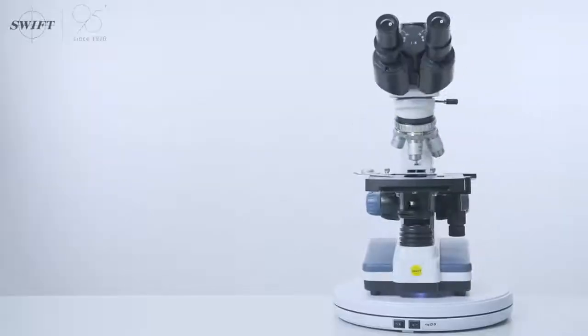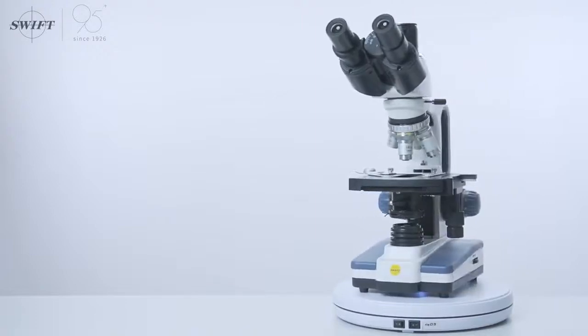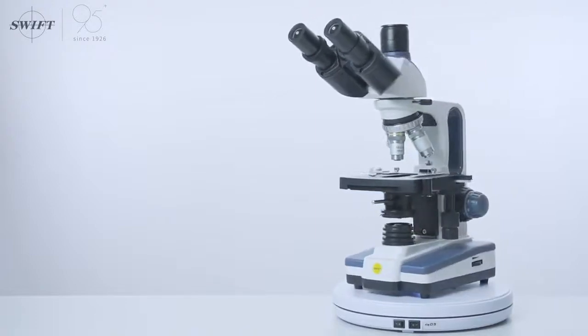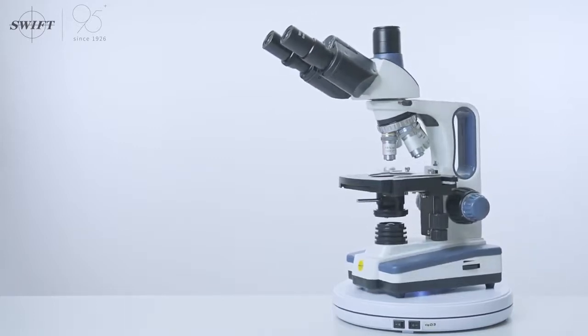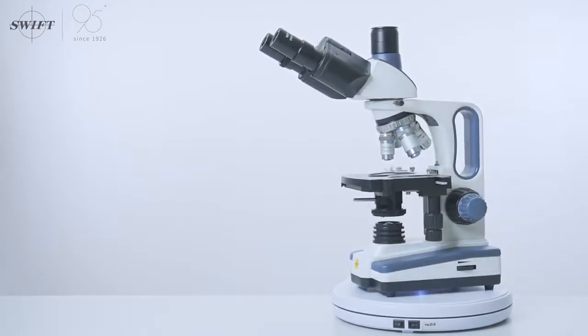This is a brand new SW350 biological microscope, which is divided into two types: binocular biological microscope and trinocular biological microscope.